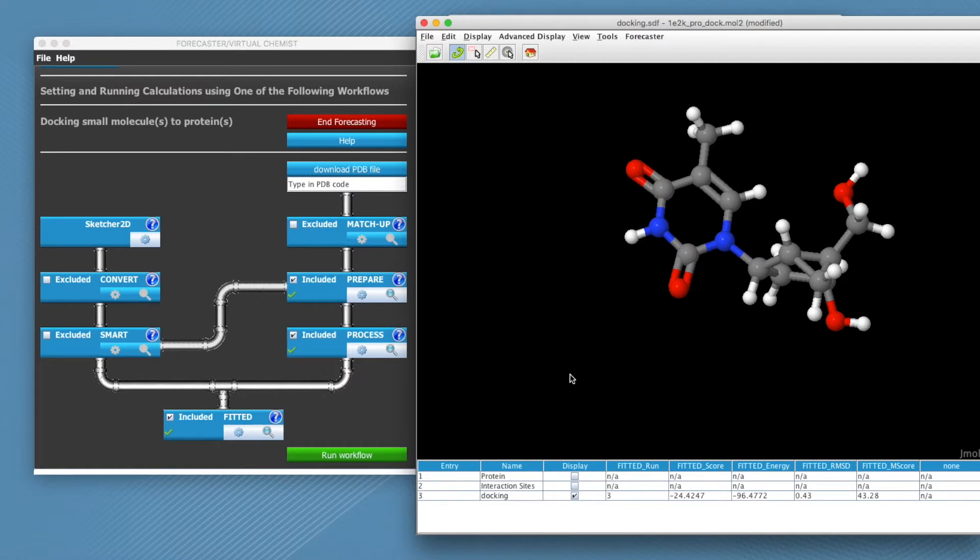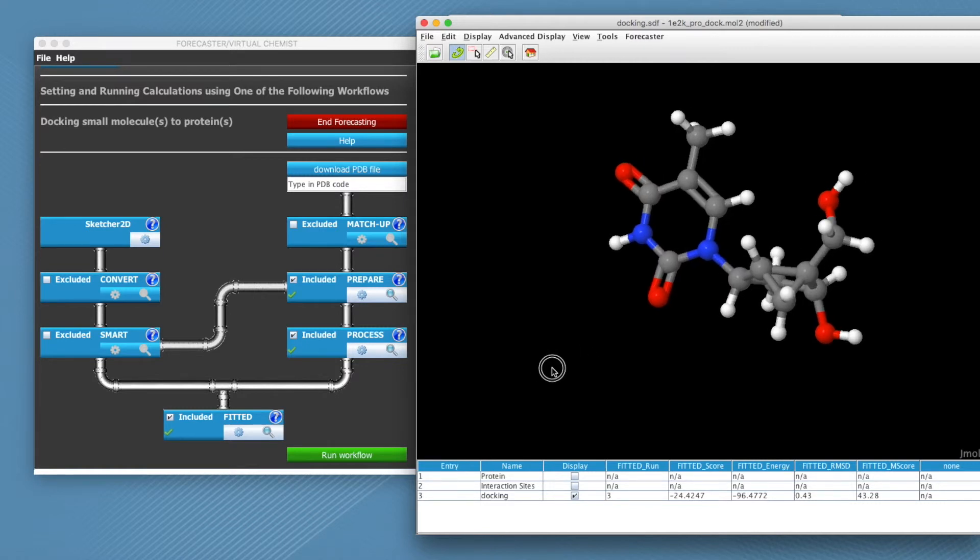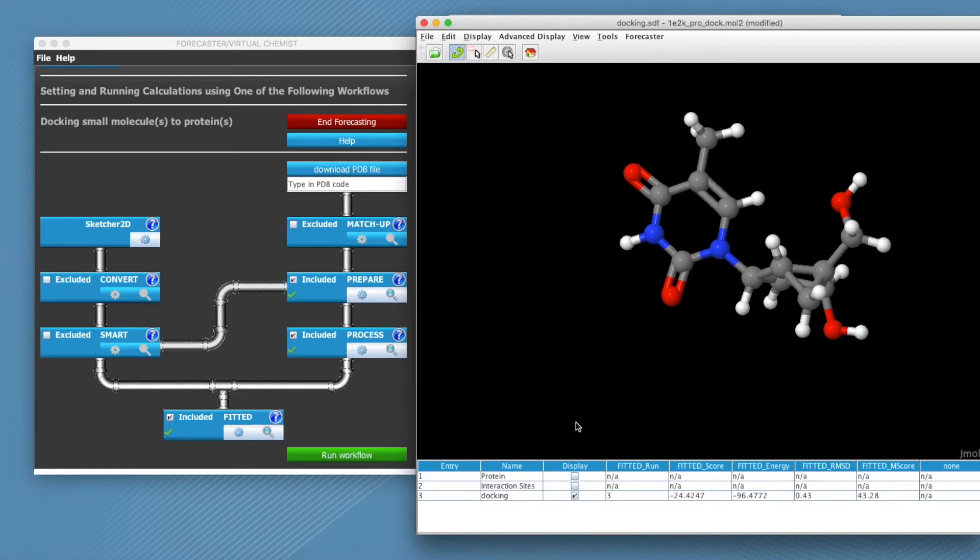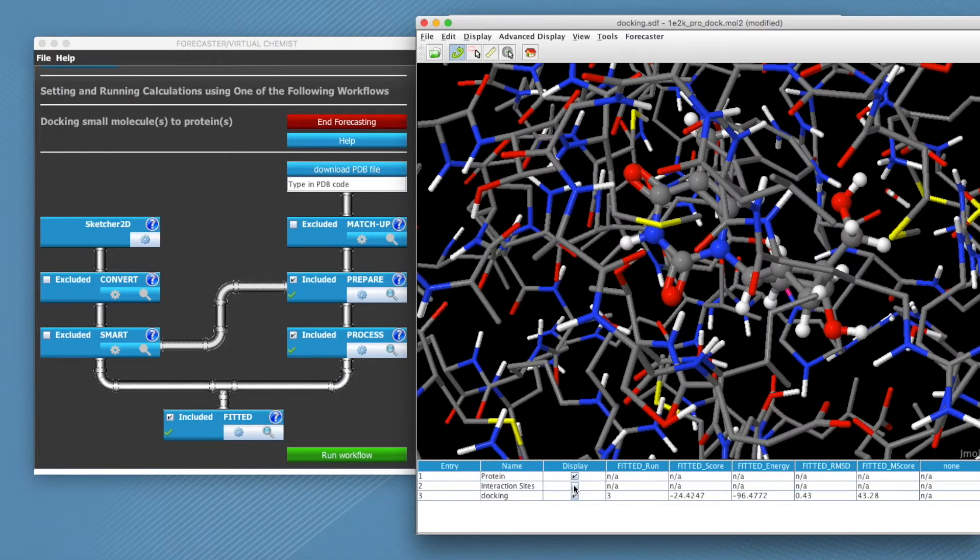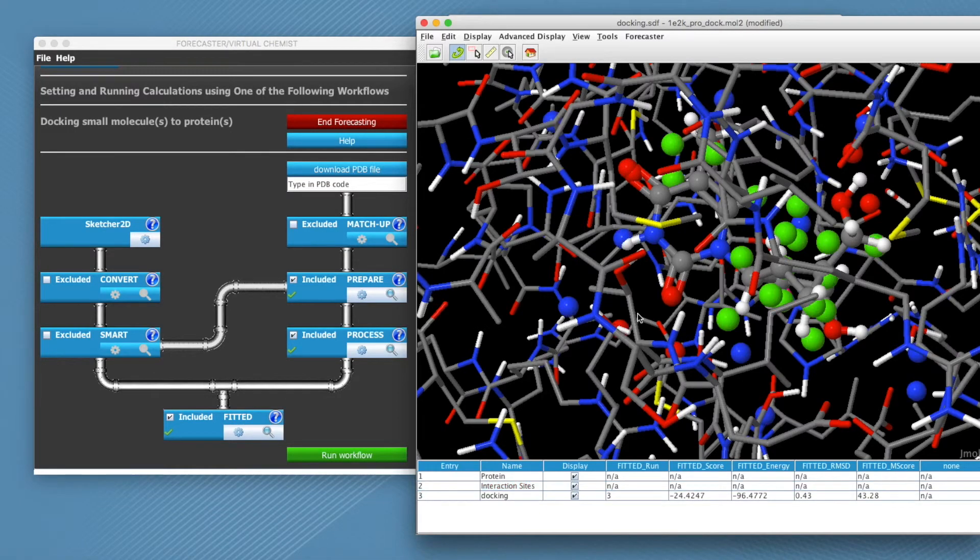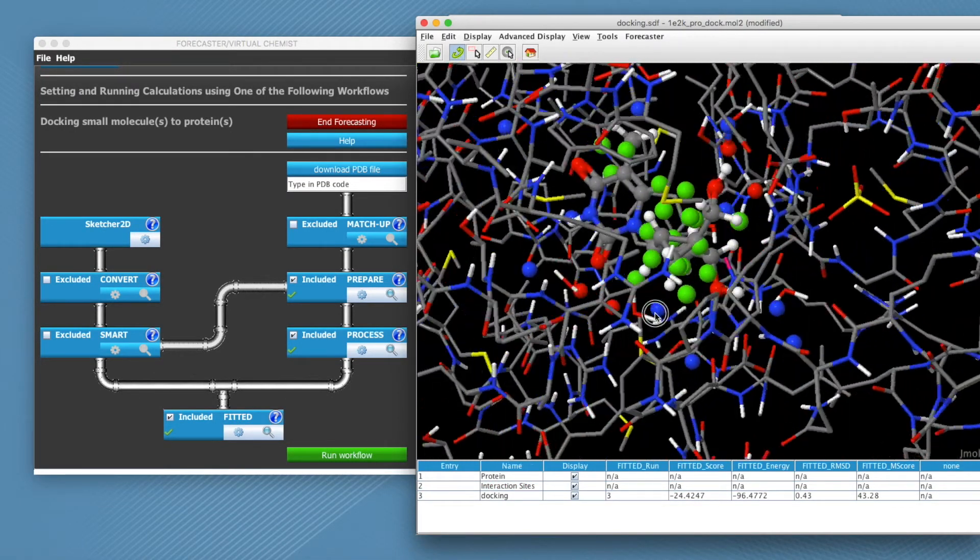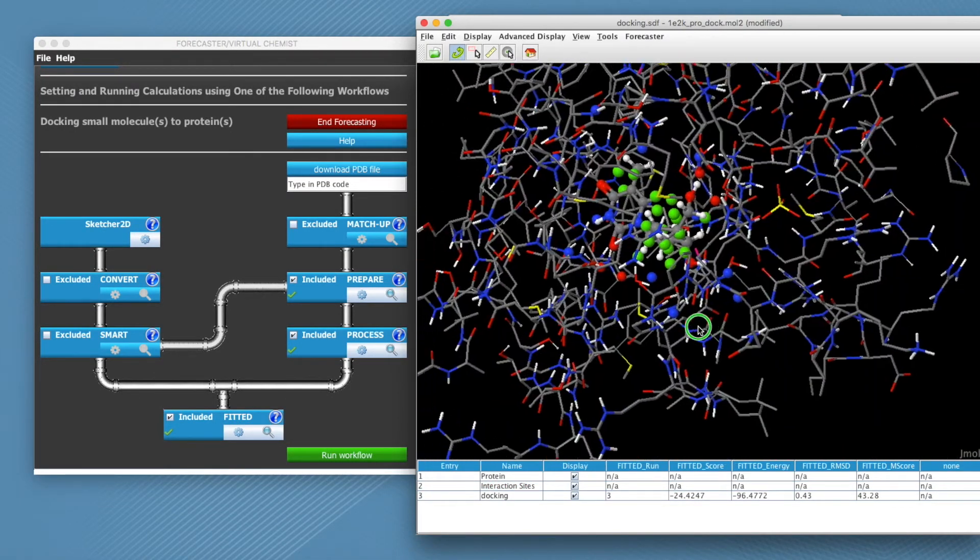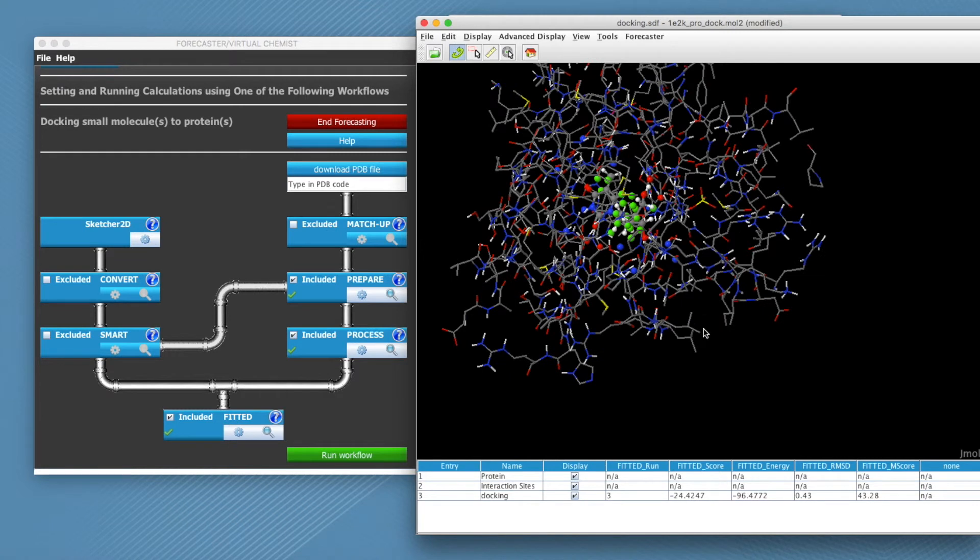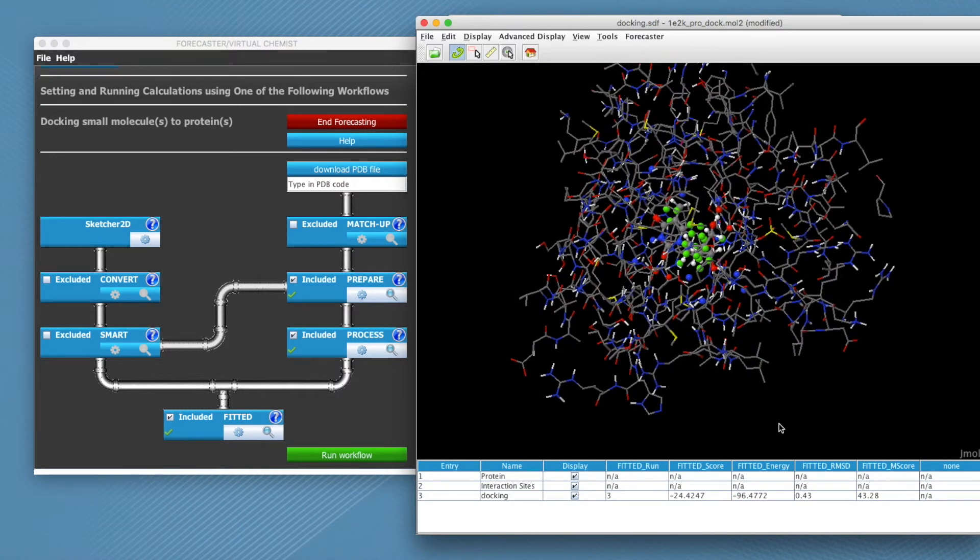In this window, you can see the docked structures in 3D, display the interactions on the protein that were deemed important and have a summary of your results in the table below.